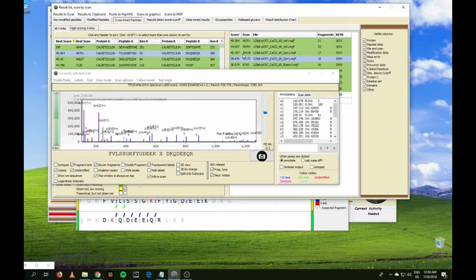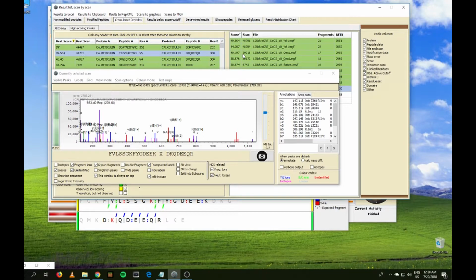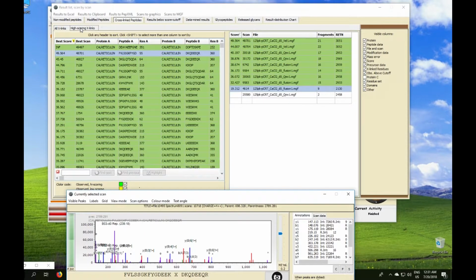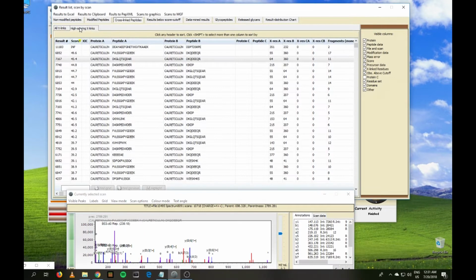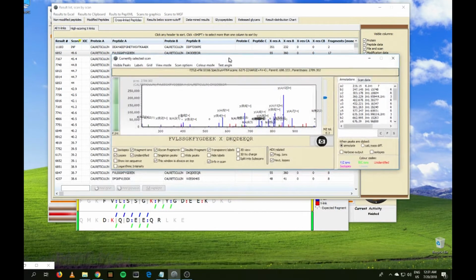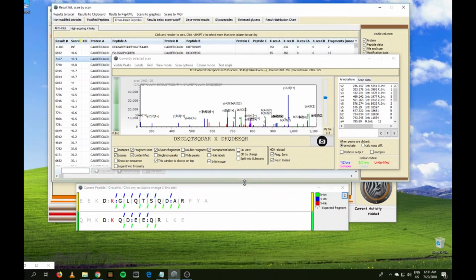Go down the list and you'll see there is a consistency between the individual scans where we have observed the crosslinks. Now, normally this is a pretty poor scan, and normally we would probably discard this as a proper crosslink because the scan really is poor. What we do see down here, this is interesting, we see the reporter ions from the BS3 crosslinks. Next to this tab, we have a list of the highest scoring crosslinks. So we just get all the crosslinks with the best score first, and you can go down to examine all the crosslinks.